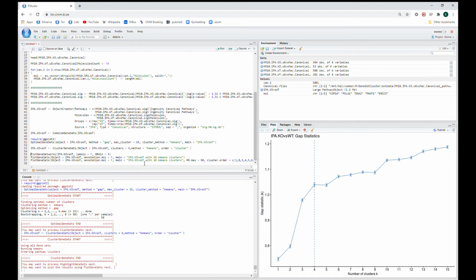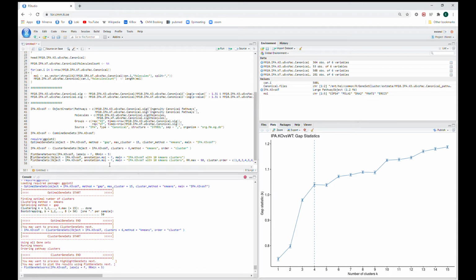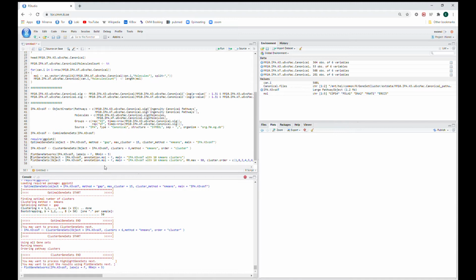And when you run it, you combine. We combine using k-means. There is also hierarchical clustering that you can use. And then we have our cluster gene set. It's that simple. That's the many lines it takes to get there. And then you can plot that using networks.